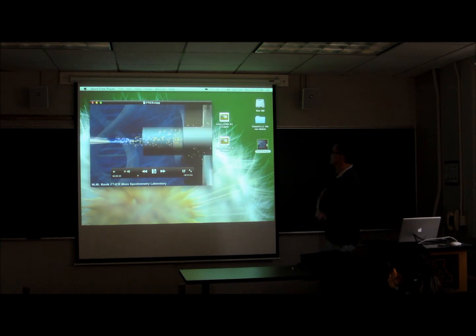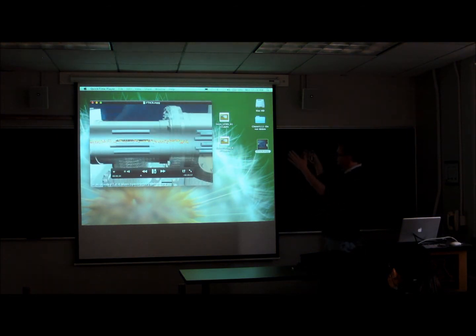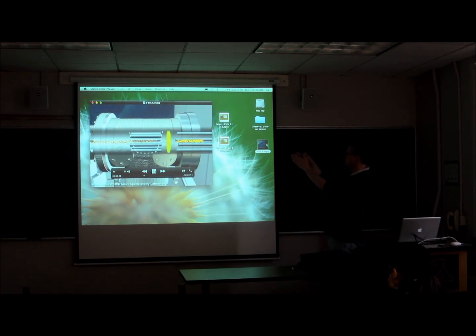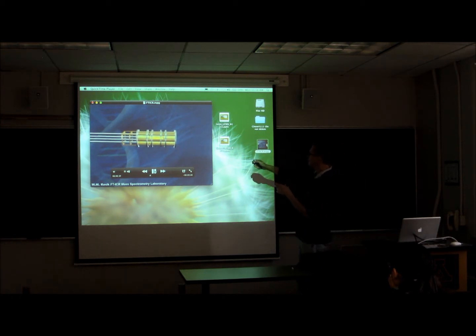They enter the mass spec, which is held at a potential compared to the electrospray capillary. They'll go through a number of focusing quadrupoles and hexapoles and things like that into distinct packets of ions. Those packets of ions are then transmitted into the FTICR cell, or ICR cell.